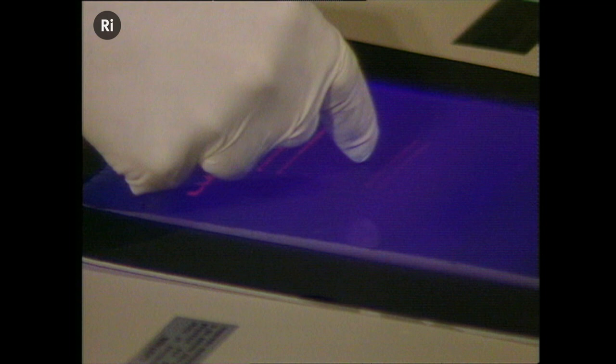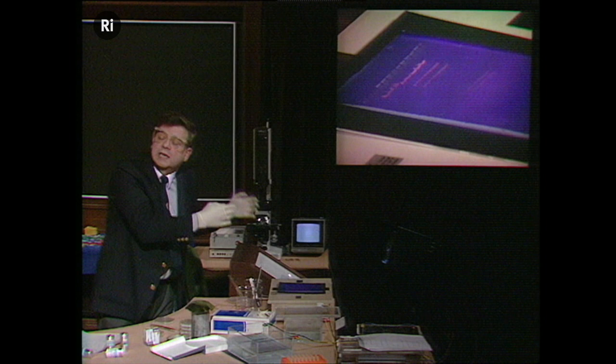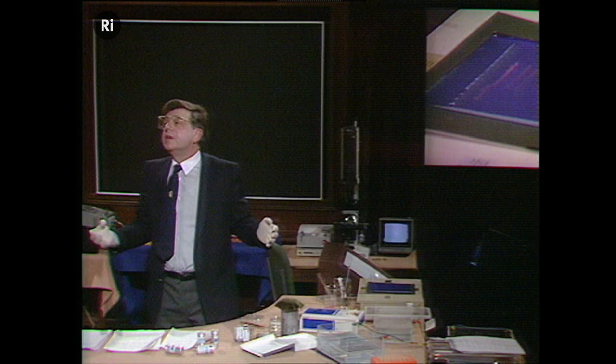We've separated those pieces by this technique of electrophoresis into their different parts, into the parts into which they're cut by the enzyme. Now we can take those pieces out from the gel and use them for our experiments.